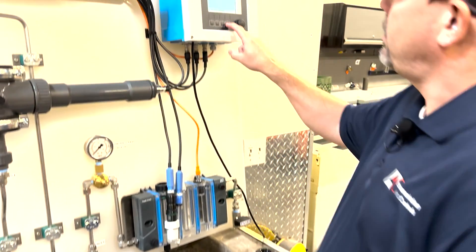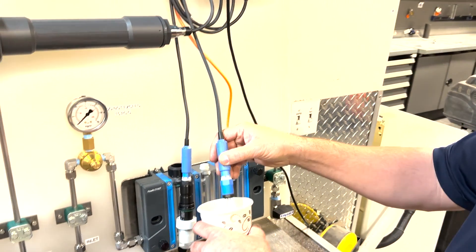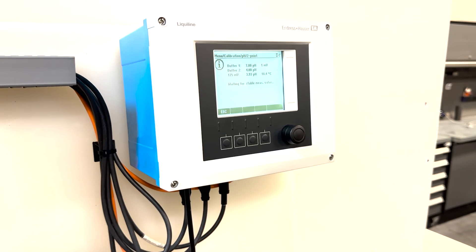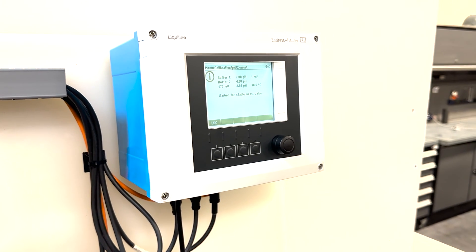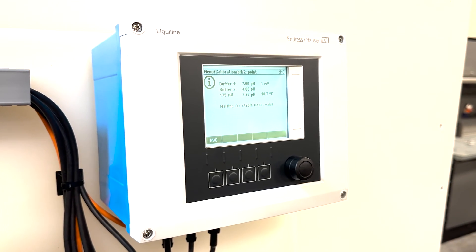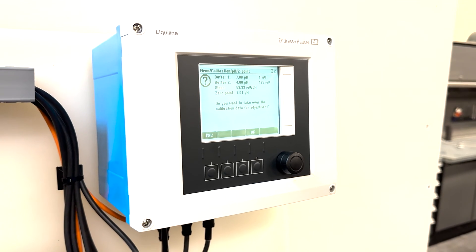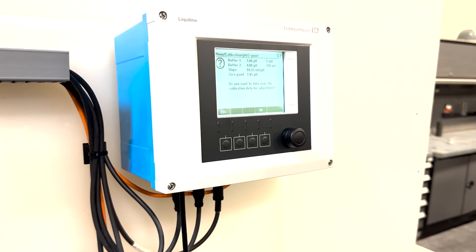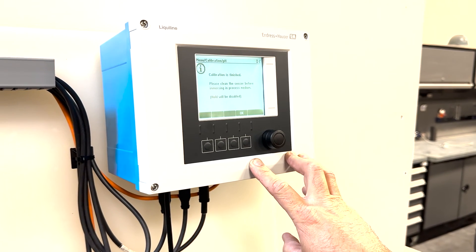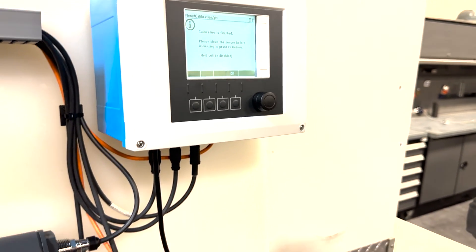Please clean sensor — you'd want to use some DI water to rinse off your sensor before putting it in buffer solution number two. Then we're going to put it in our second buffer solution and wait for a stable measurement. You can see it's adjusting, reading live. Once it stabilizes, it will ask: do you want to take over the calibration data for the adjustment? If you feel like it's a good calibration, you would say OK. Calibration is finished. Please clean the sensor before immersing in the process medium — use DI water.